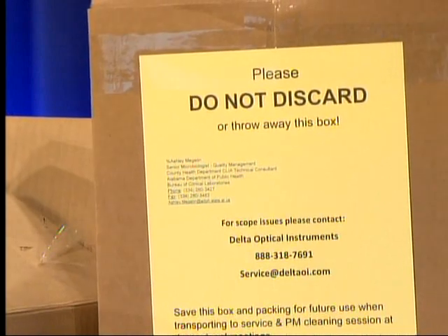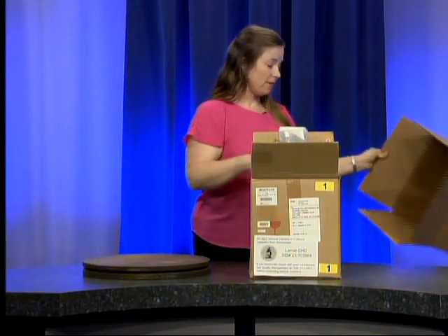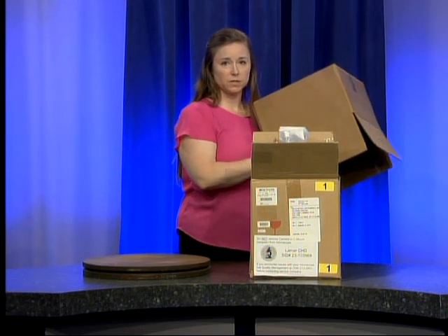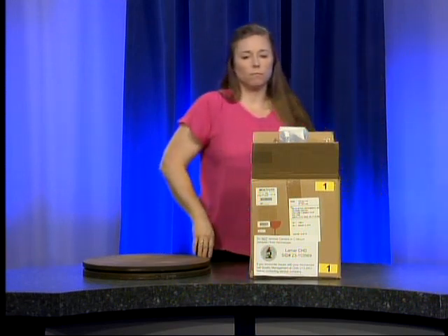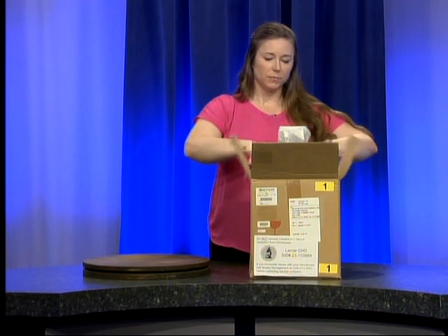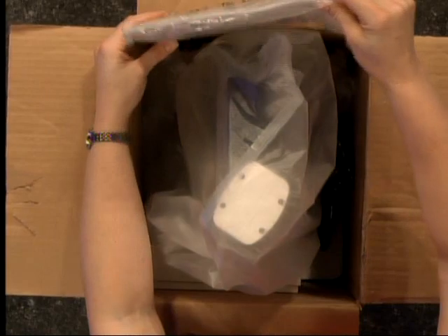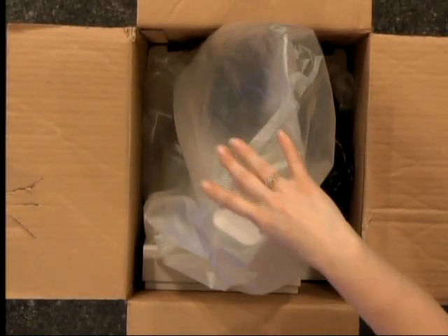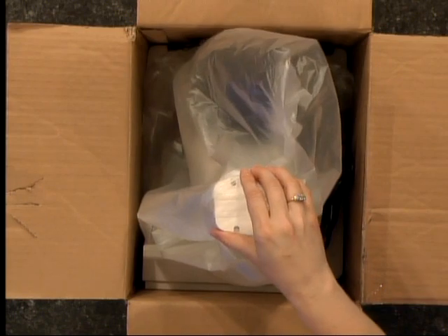The top of this box also says do not discard or throw away this box. We actually want you to keep both of these boxes — they will be very helpful to you if you have to transport the microscope for cleaning or for service, so don't throw away either of these. We've packed these boxes with all of the same items, so if you don't have everything in this box please let us know and we'll get you what you're missing.